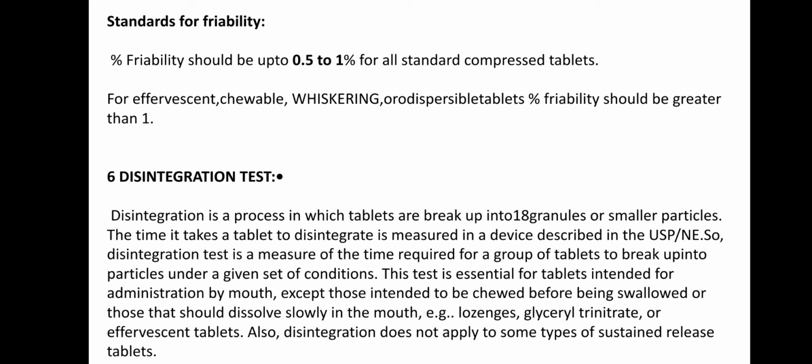Disintegration test. Disintegration is a process in which tablets break up into granules or smaller particles. The time it takes a tablet to disintegrate is measured in a device described in the USP. So the disintegration test is a measure of the time required for a group of tablets to break up into particles under a given set of conditions.